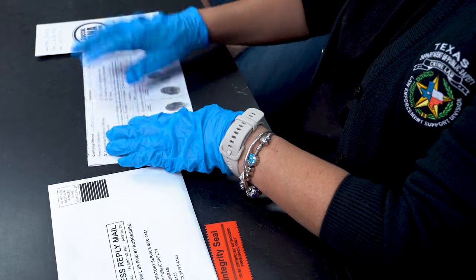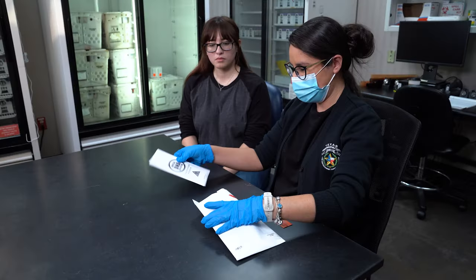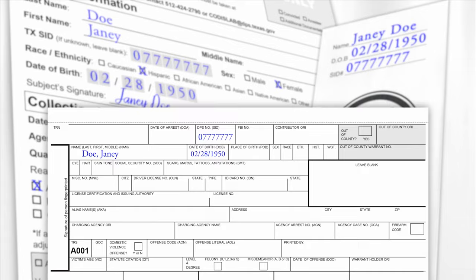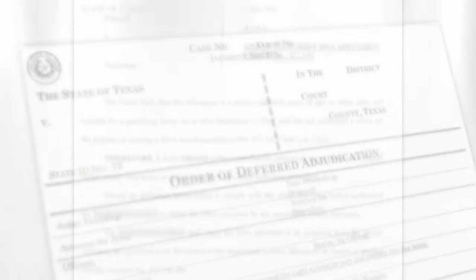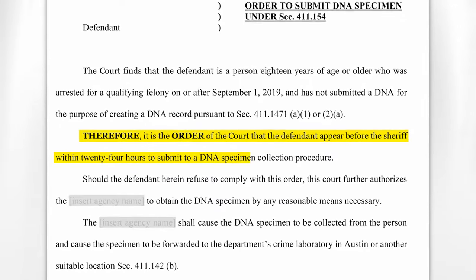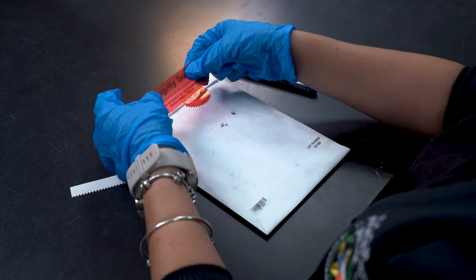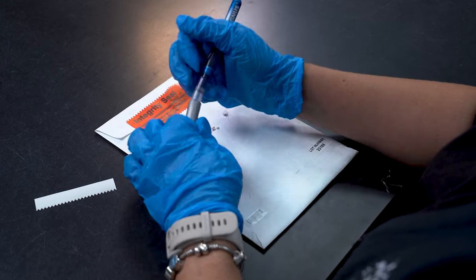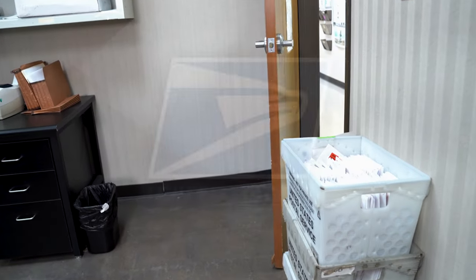Place the transport pouch and the DNA database card into the prepaid postage shipping envelope. If submitting additional documentation with the kit, such as a copy of the live scan printout, verify the subject's identity on the documentation matches the identity on the data card and transport pouch. If you are collecting for deferred adjudications, include a copy of the conditions of supervision with the kit that specifically states that a DNA sample collection is required. Please verify that the name and SID on the documentation matches the name and SID on the data card and transport pouch. Peel the backing from the integrity seal and place it on the shipping envelope to properly seal it. Initial and date the kit. A kit will not be accepted without an intact seal. Kits should be mailed to DPS as soon as possible and no longer than three business days from the date of collection.